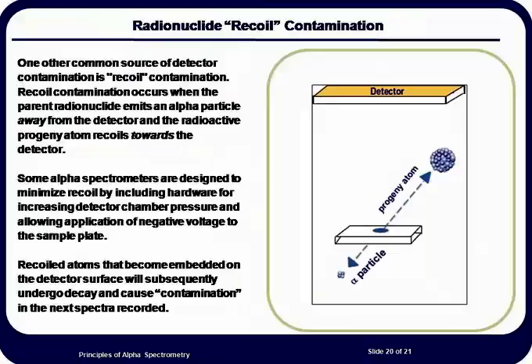When an atom undergoes radioactive decay, the emitted particle takes away energy and momentum. Since the energy and momentum must be conserved in any physical process, the nucleus must recoil with a certain energy. When the alpha particle is emitted in a direction away from the detector, the recoil of the residual atom is in the direction of the detector.